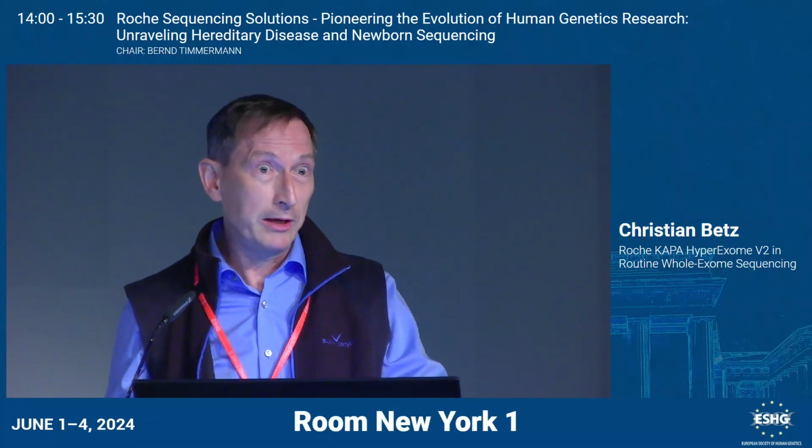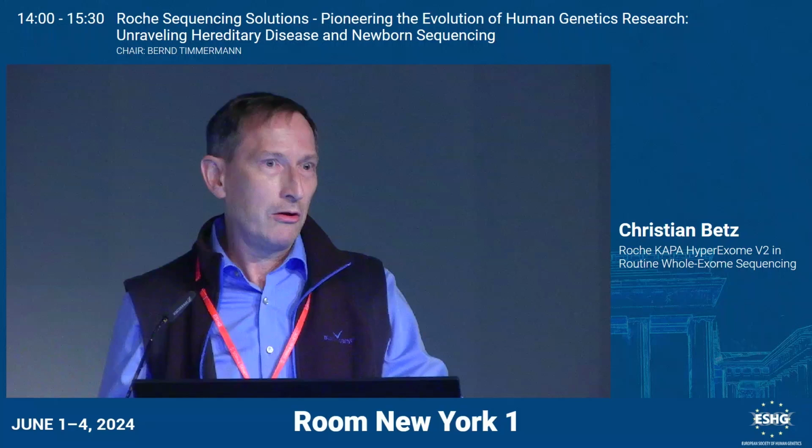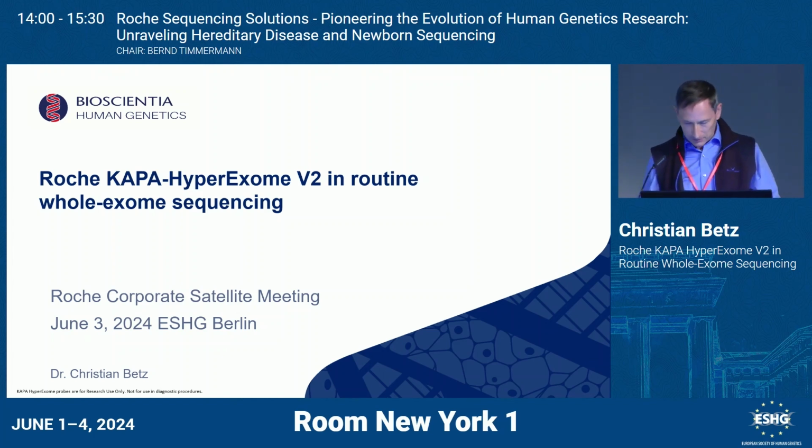For example, we have a booth here at the ESHG that is focusing mainly on long-read whole genome sequencing, our newest application, but the backbone in our molecular genetics department is still whole exome sequencing, and I will explain today how we have established it. It's a really application-based approach to show you how our lab is run, how we do the best throughput and the cost-effective use of an exome-based approach.